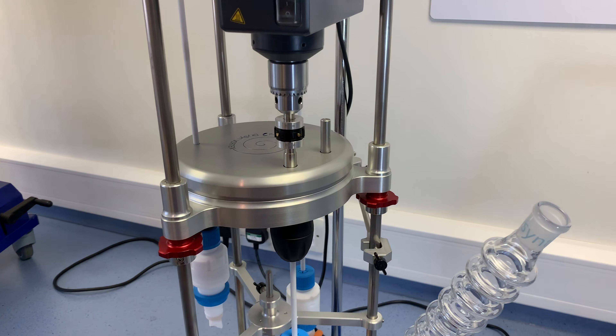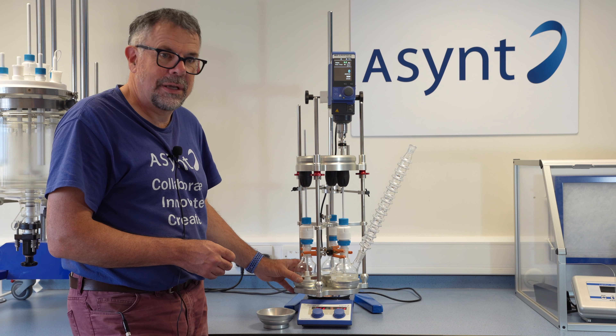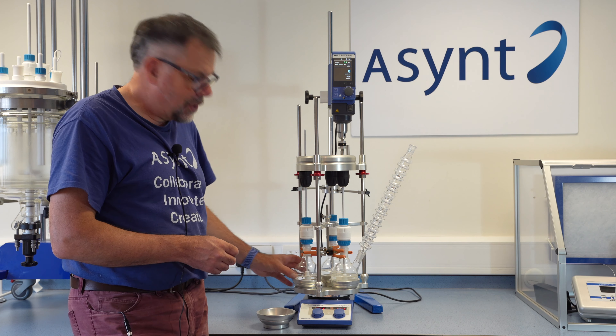Vortex is very sturdy — with the extra support stand, it's not going to be moving anywhere in your fume hood, even at high speeds. We also offer Vortex as a version called Blend, which instead of round-bottom flasks works with open-top beakers up to 600 millilitre standard-size Schott Duran beakers. That enables customers who want to blend oils, paints, etc. easy access to beakers, three at a time, again with temperature control.